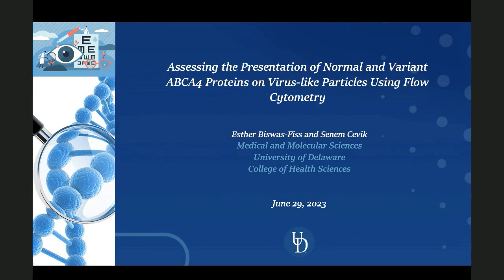And we're going to talk to you today about how we use the flow cytometry core facility through the voucher program to assess the presentation of normal and variant ABCA4 proteins on virus-like particles. Okay, so let's get started. What is ABCA4?